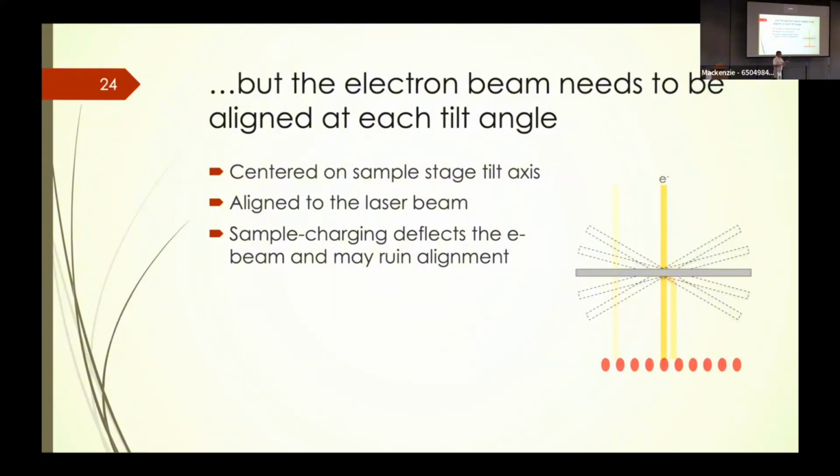And so what you do is you take a slice of a cell and image it from several aspects, right? The problem with that is that unfortunately the specimen becomes inevitably charged by the electron beam. Now that's a routine thing that occurs all the time. It's relatively harmless in standard electron microscopy, and there are ways to reduce it, for example, coat it with a conductive layer.